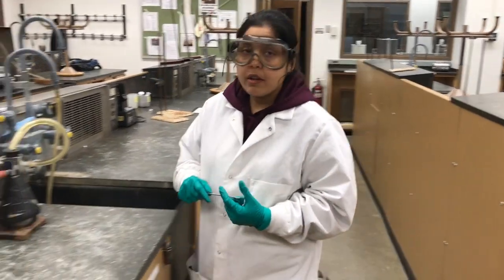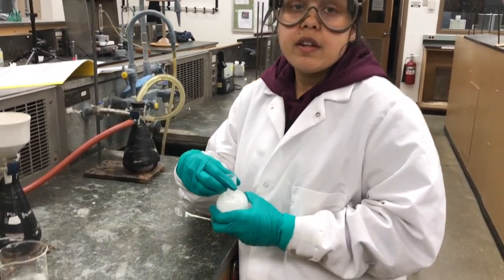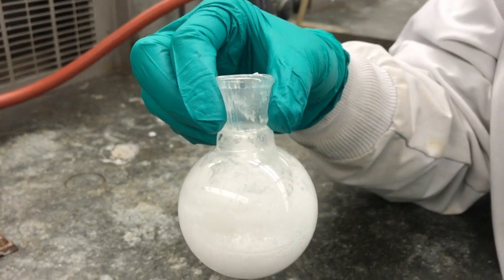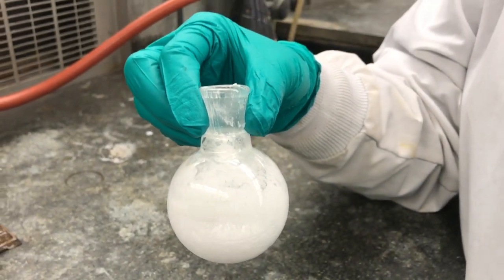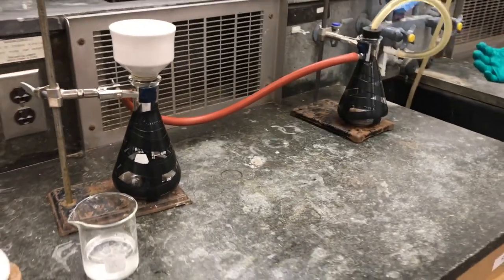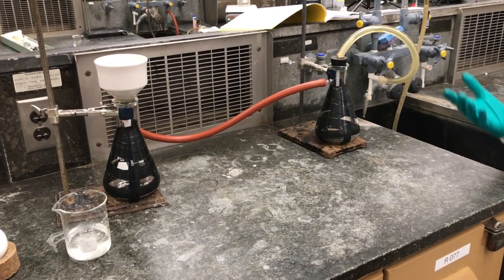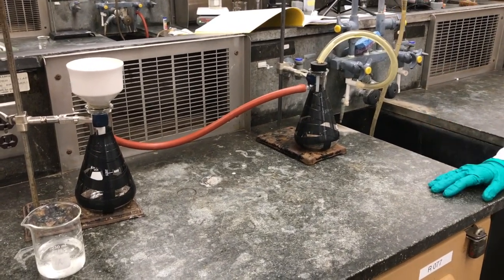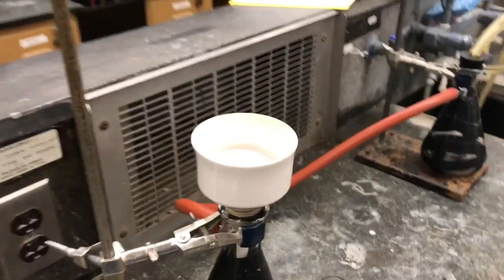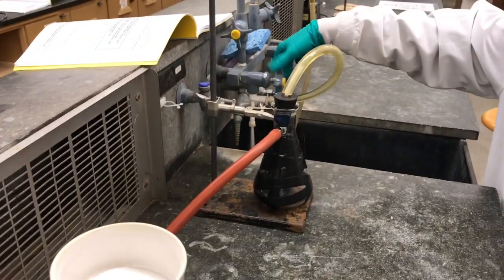So we are back with our reaction product right here. As you can see, the white foamy stuff is under acidified condition right now. We need to isolate our product using vacuum filtration. This is the vacuum filtration setup. We have two filter flasks on both sides. You guys have used it before in this semester. What we're going to do is rinse our filter paper with cold water and pour our solid reaction mixture.